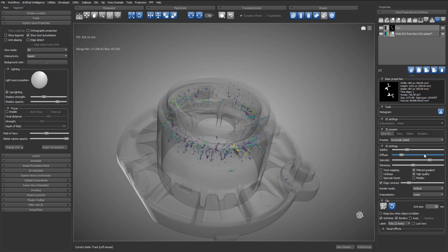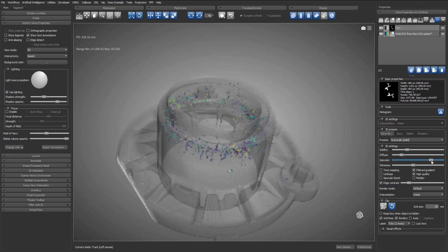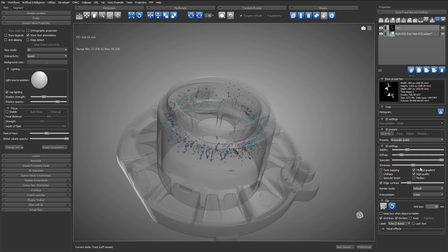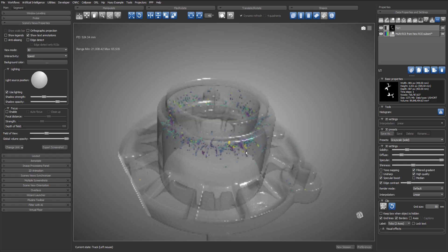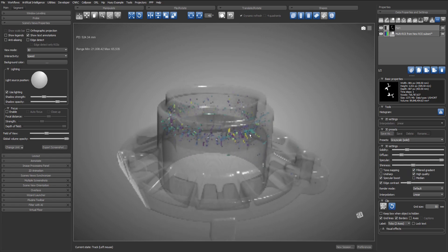Then adjusting the diffuse and specular again. I'm now ready to export some images.